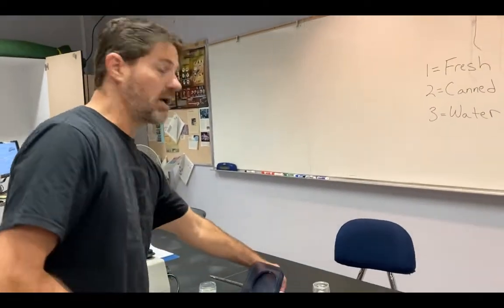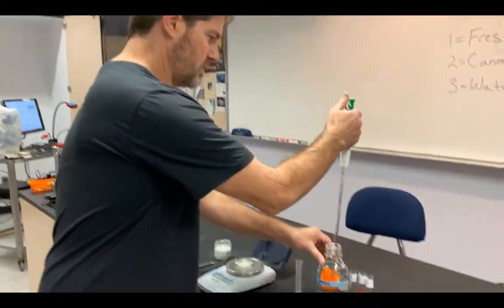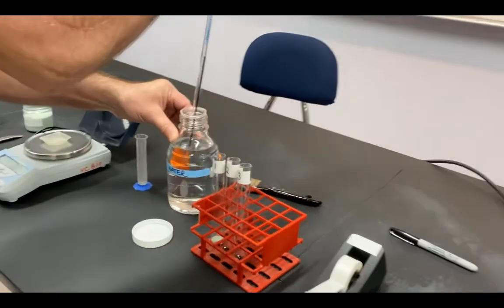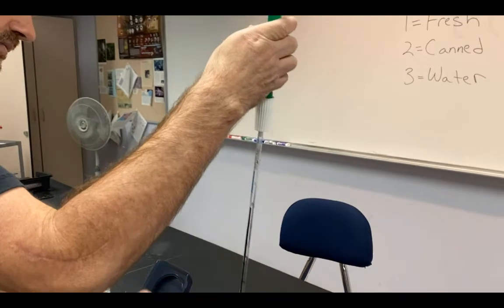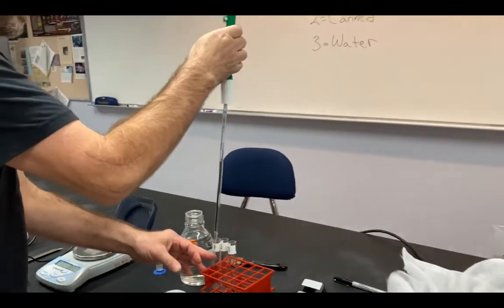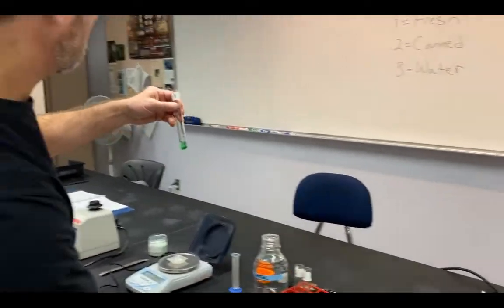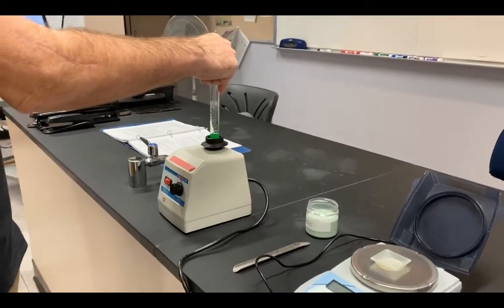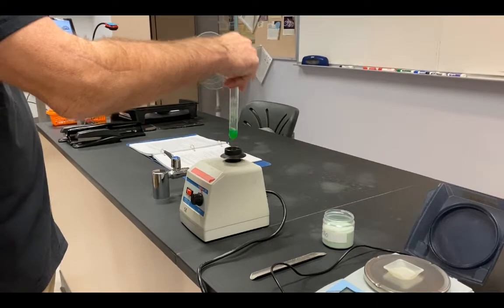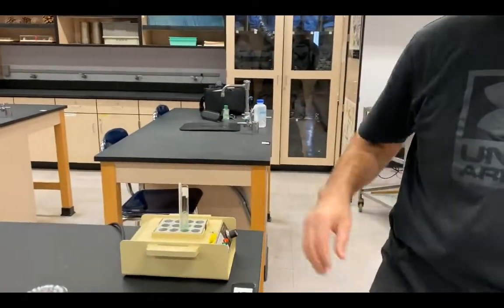I also need to use a pipette to add 2.5 milliliters of water to each tube. I'll suck up 2.5 milliliters and add that to my tube. Once done, I'll vortex the sample to get mixing started. Some powder will cling to the side, so I'll warm this in a dry bath and vortex again to make sure all the powder is dissolved.